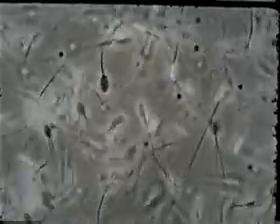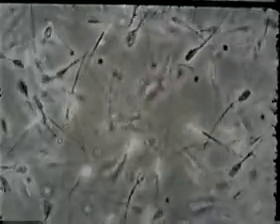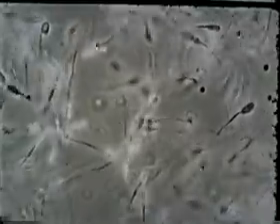Such sperm often move in wide circles rather than straight forward, which is so characteristic of the swimming movements of mature rabbit spermatozoa. The flagella appear more or less straight. A few sperm retain the droplet, and when present, it is located at the junction of the midpiece and the main piece.